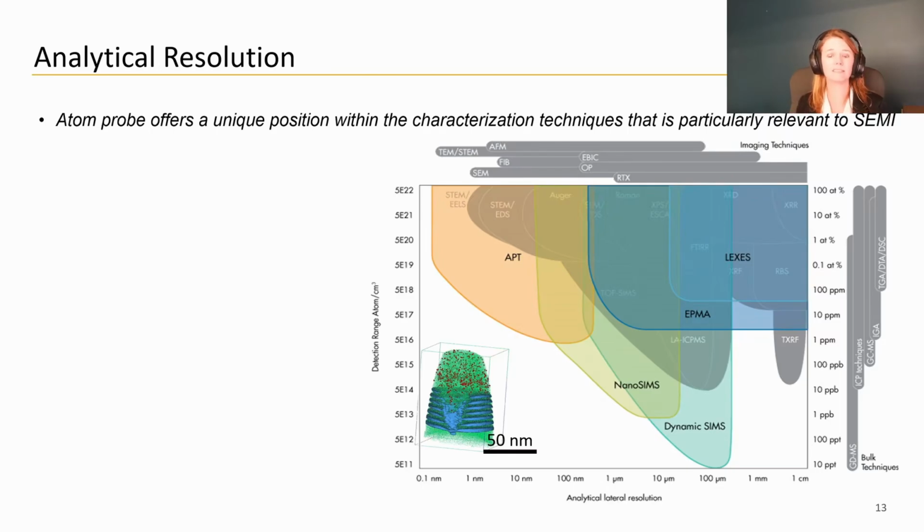Now, ultimately, the sensitivity of any of these techniques is going to depend on how many atoms are being sampled. For Atom Probe, that's not always determined by the analyst. A lot of times the sample determines how many ions you collect. At some point, samples can't undergo the stress of this process of evaporation and they break or fracture.